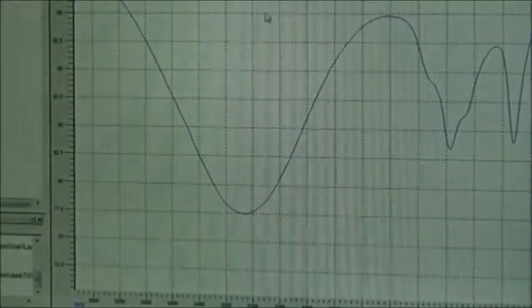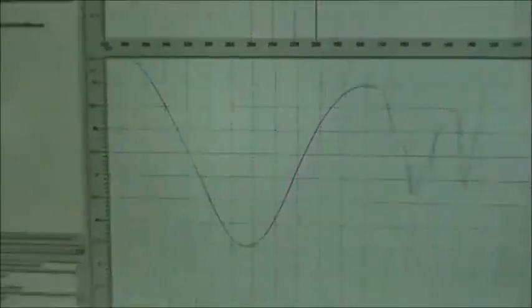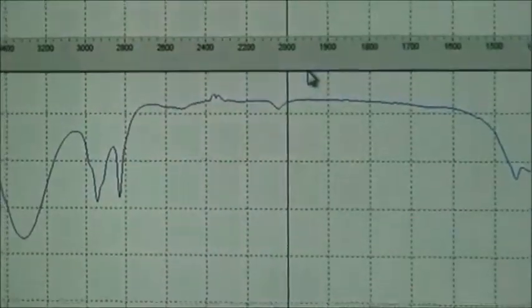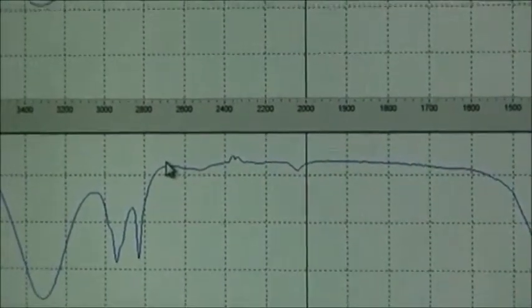Good thing about this machine is everything has a help button. So if you get confused, you can always use the help button. And I'm just going to come back down here to the full view for a second. Okay, so we're going to take this back to our view. And I'm going to show you guys now the accessory that we use if we want to use solid samples.